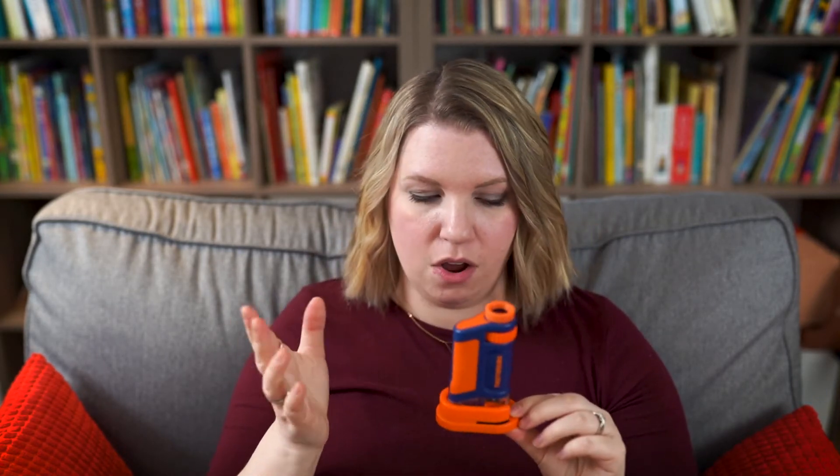The other thing I love about this microscope: you can either use it on its stand with slides and set things up like that, or you can separate it from its stand and it becomes a great little portable microscope that you can take to look at things that are not necessarily going to be on a slide. We can take this outside to go look at leaves up close, or butterflies, water samples — all the things that kids want to look at and make bigger.